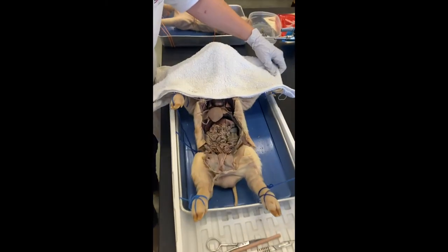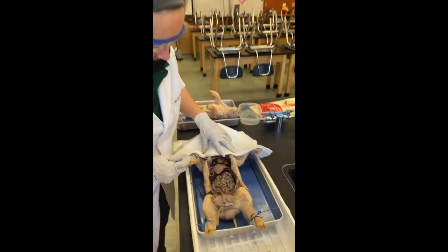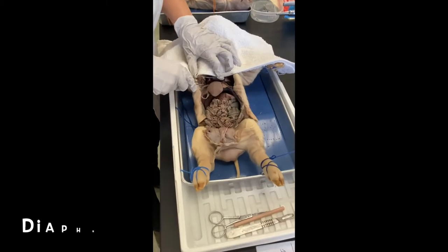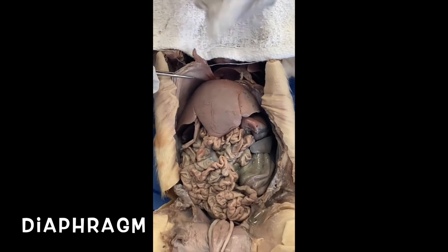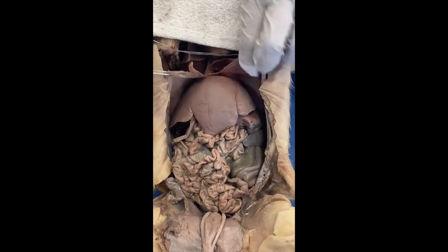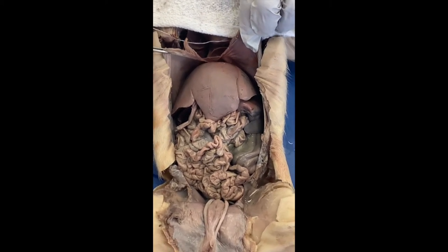All right, you guys, just like surgery, we don't need to look at the parts we're not operating on or focusing on. So cover up the pig here for you. Uh-oh, you saw the heart. So here we are. This is a little bit better. We can see the diaphragm here that moves and contracts as we inhale air and then moves up as we exhale. So there's that separating muscle really keeping our abdomen from our chest.